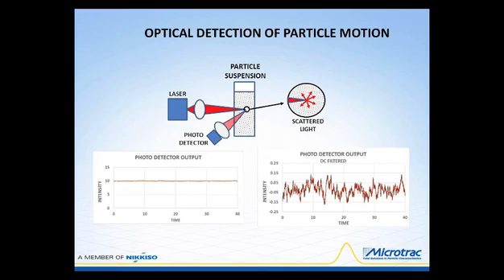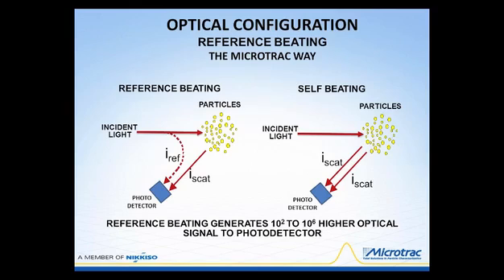But the noise is the result of the particles moving and interacting with the optical beam, and it's through the analysis of that noise spectrum that particle size distribution can be extracted.